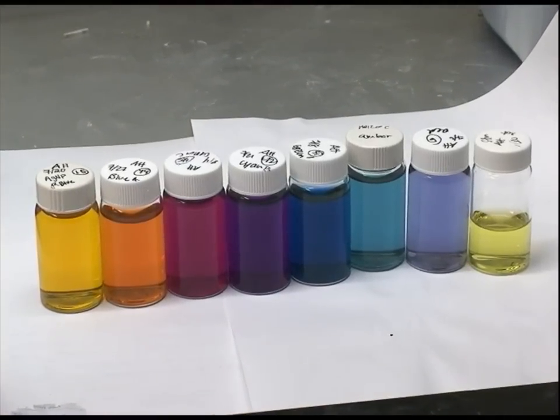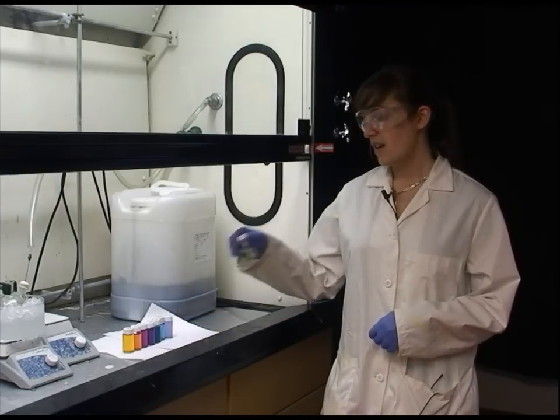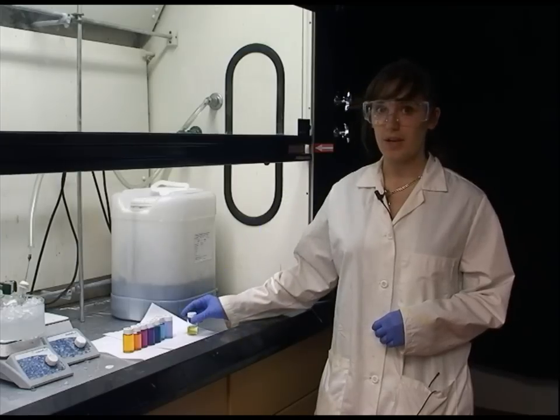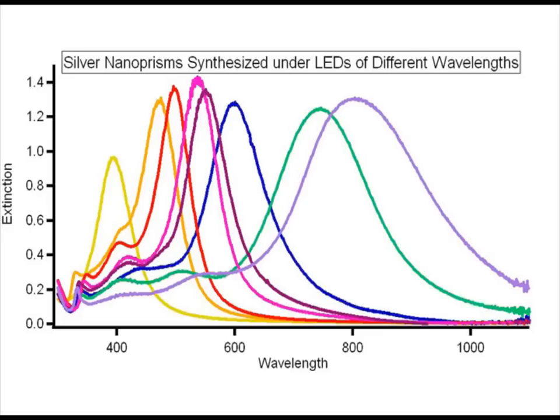First I will be synthesizing silver nanospheres, and these will be converted to the larger silver nanoprisms by putting them under an LED of a specific color. Based on the color of the LED I can get different colors of the resulting colloid.